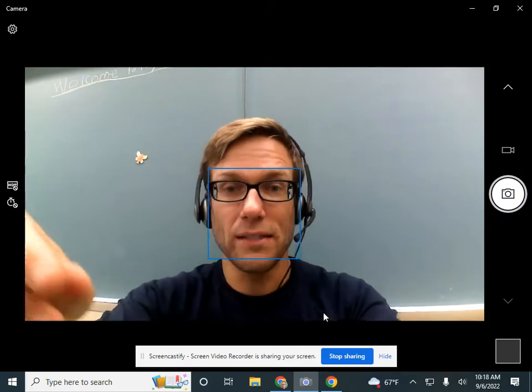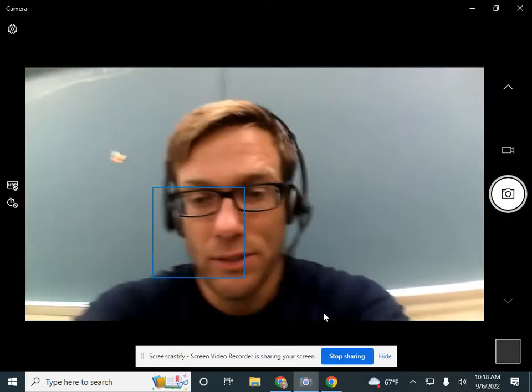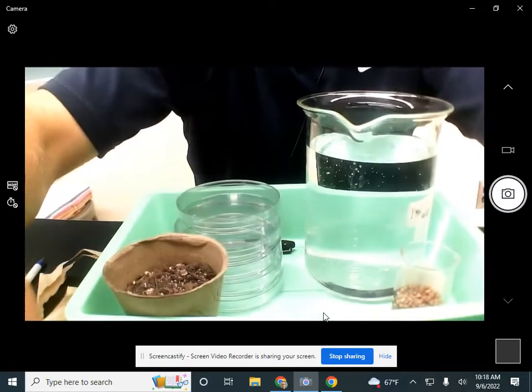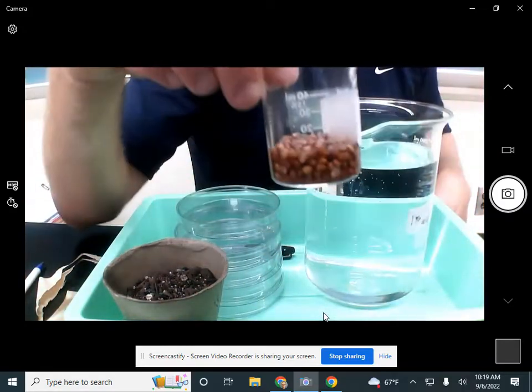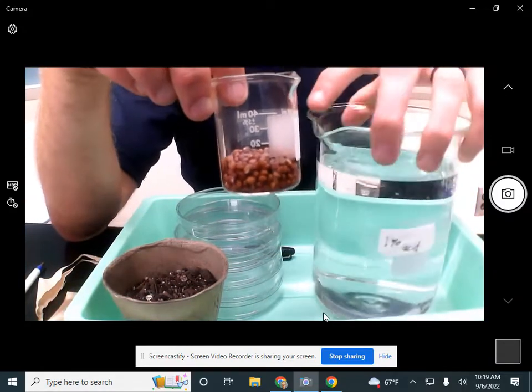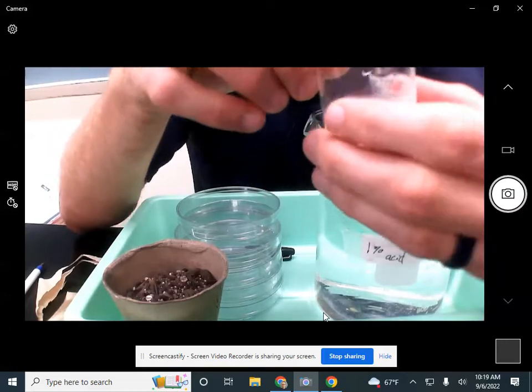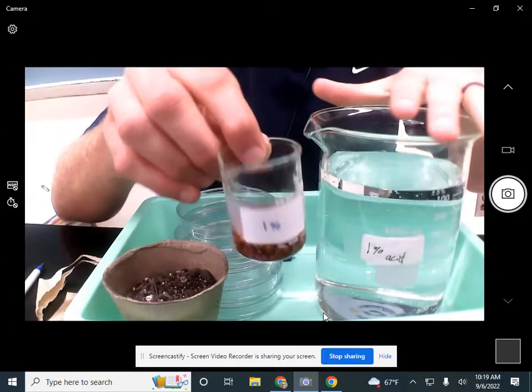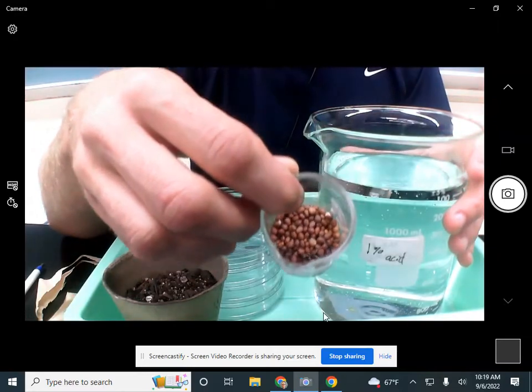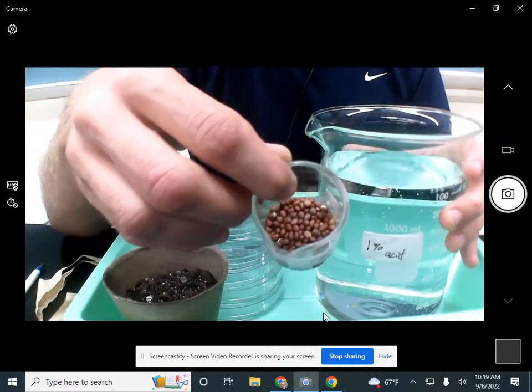And you also have several other things in this bin. Let me show you those right now. These are radish seeds that have been soaked in this acid concentration. So the 1% seeds have been soaked in 1% acid. Radish seeds were chosen because they germinate so quickly.